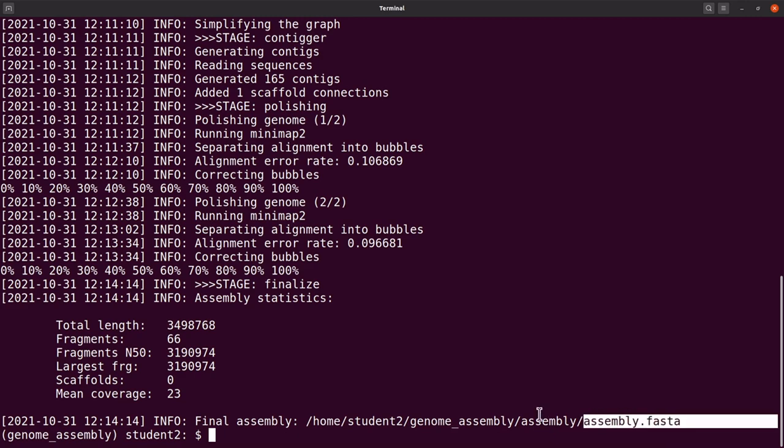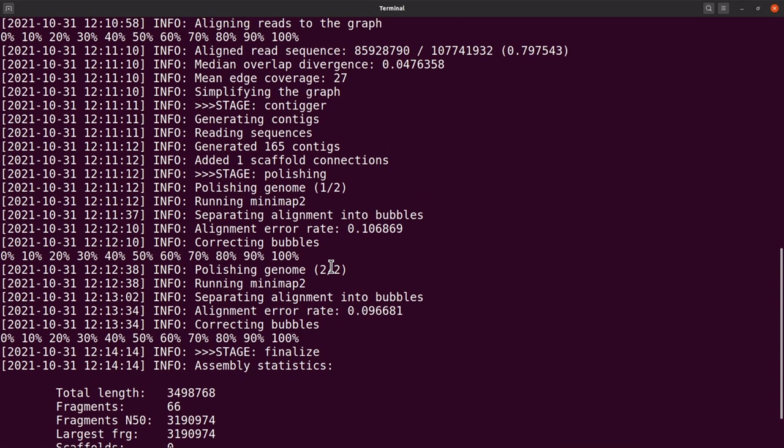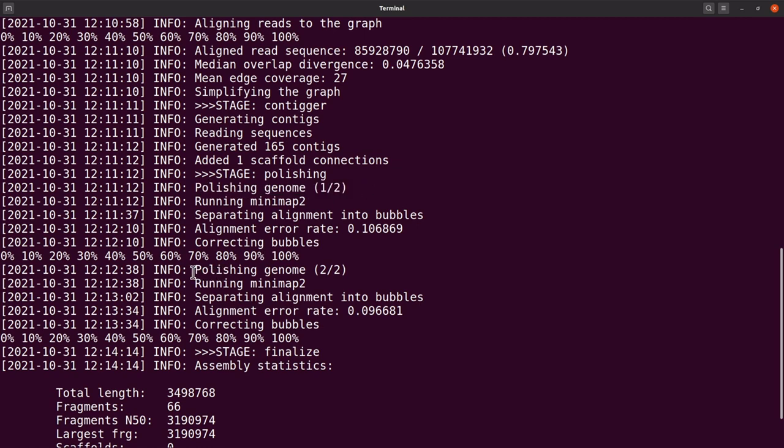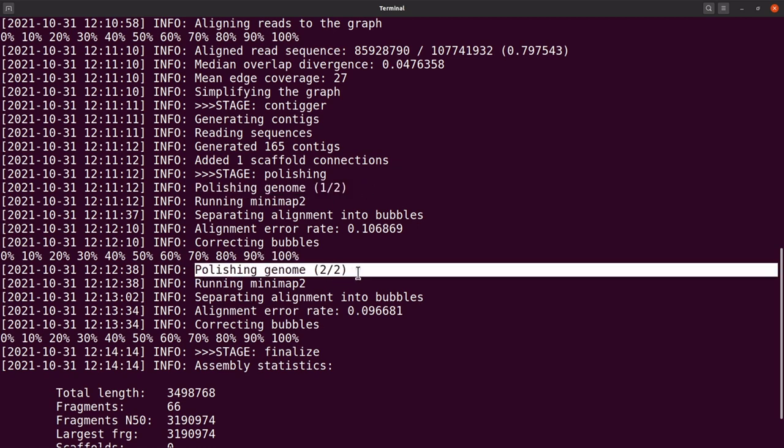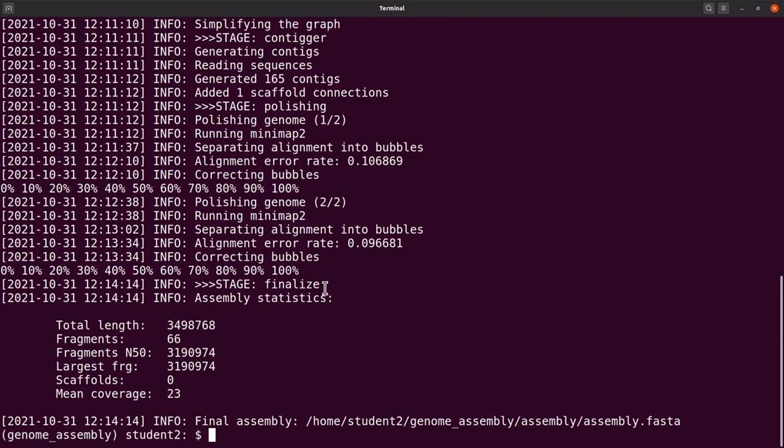Before I go, let me also say that notice that we had polishing, we did i=2, and so we had two iterations, which is this one. Notice this one: polishing genome 1 over 2, polishing genome 2 over 2. So that's how it is. You can increase it, and the higher the number, the longer it will take for the assembly to compute because these are iterations. That means it will have to go over and then redo some of the stuff again.